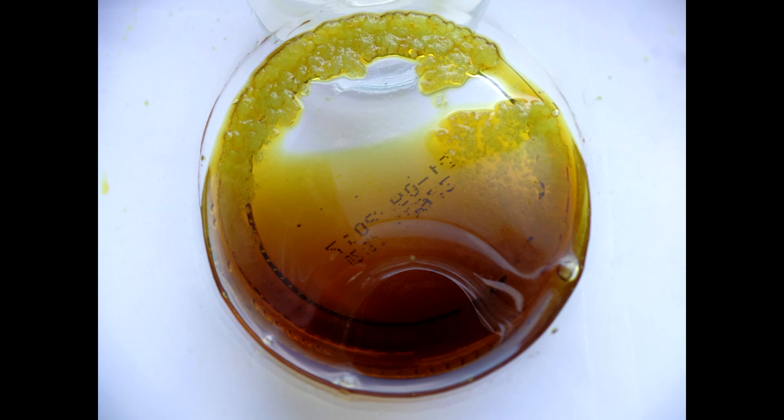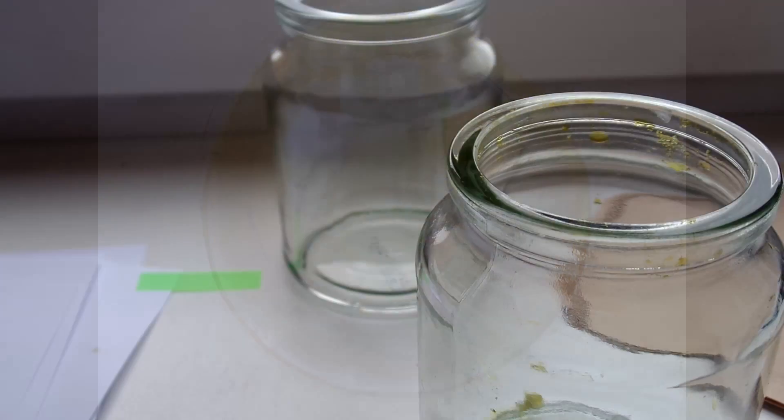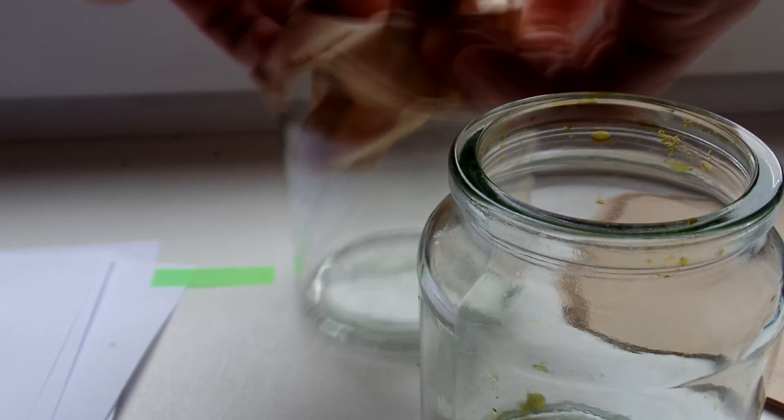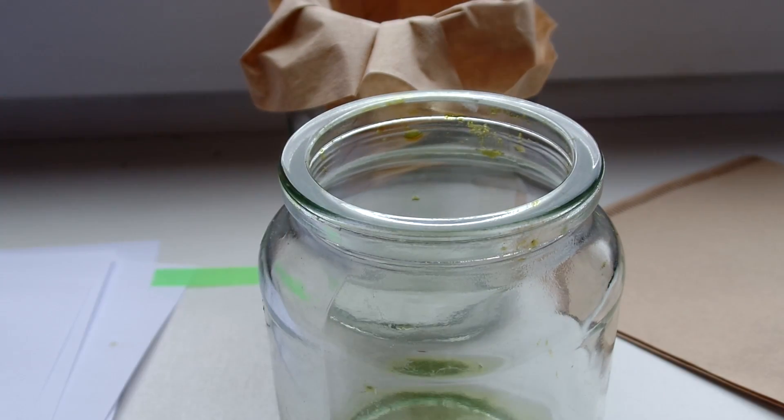The solution is cooled in the fridge for a day or two. These are the crystals of iron chloride. They are filtered off and washed with acetone, then dried.